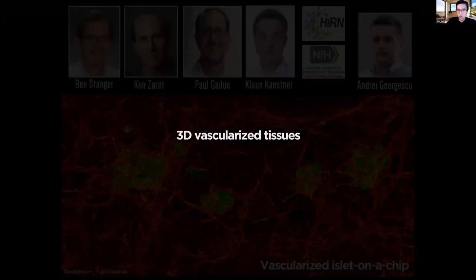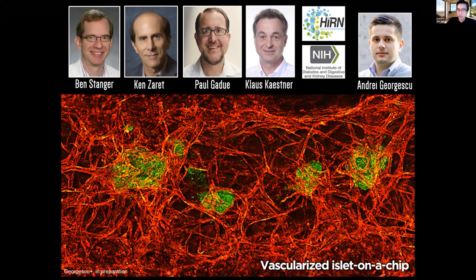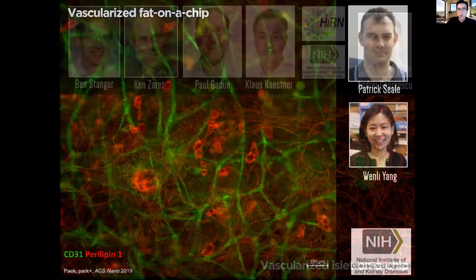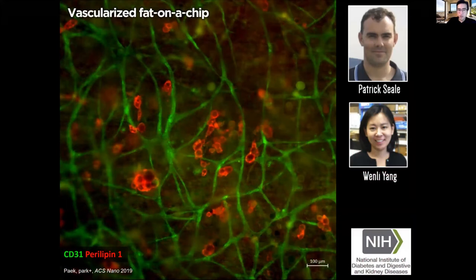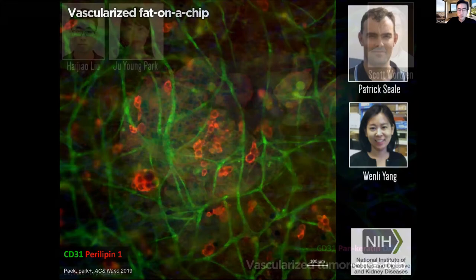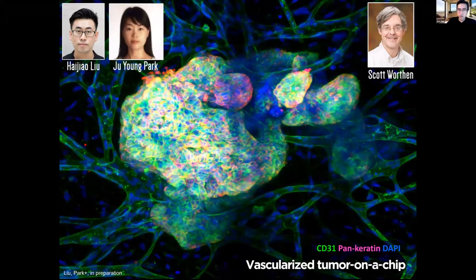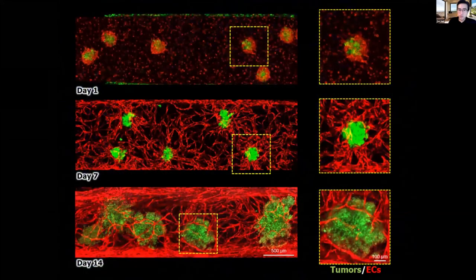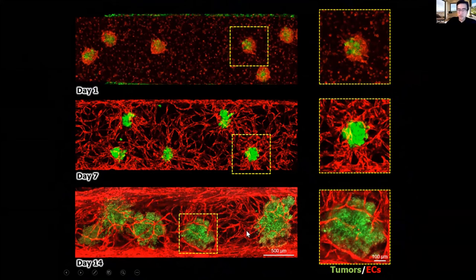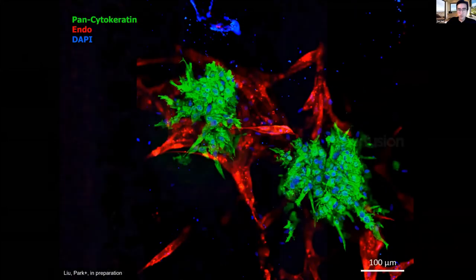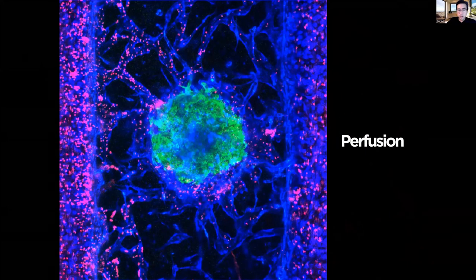One example is our pancreatic islet on a chip. We get donor cadaveric islets, put them into our devices, and vascularize them — supporting their structure and function for long periods of time. We can also engineer fat tissue containing blood vessels using stem cells. And this is a tumor construct in our device: we get tumor explants from a collaborator at the hospital, chop them into small pieces, put them into our device with vascular cells, and over time form heavily vascularized tumor constructs that can be perfused with cells, drugs, and media.